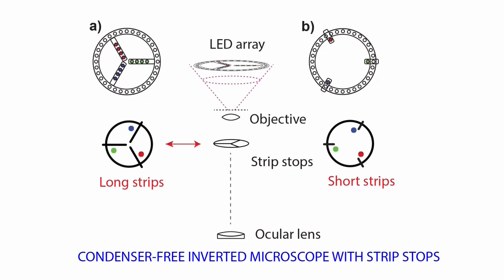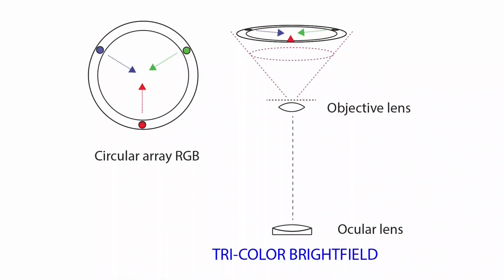In practice, the secondary illumination sources would need to be considerably brighter than the typical LEDs. This could be achieved by tightly focusing the LEDs instead of letting them spread out at 60 degrees. Alternatively, we could use focused fibre optic sources. The next diagram shows a similar layout for fully oblique tricolour bright field without any other sources.